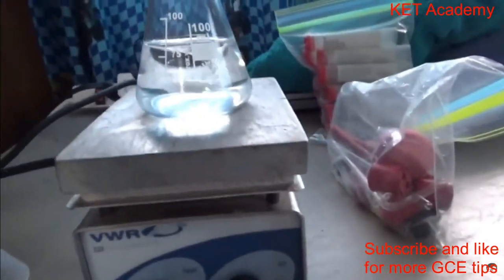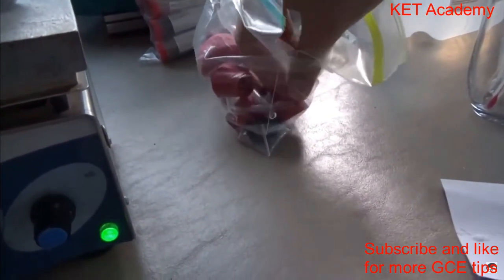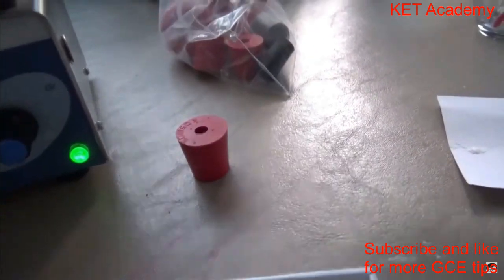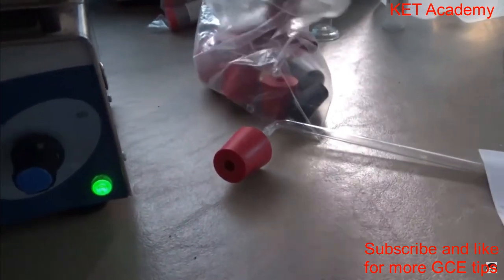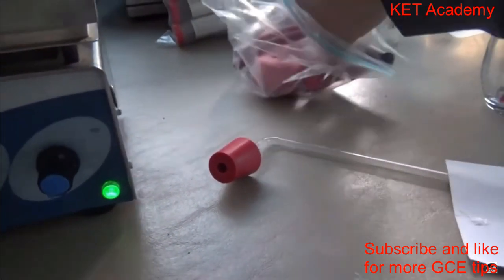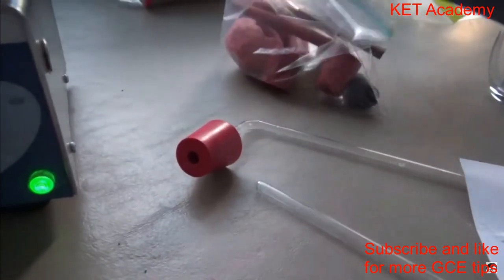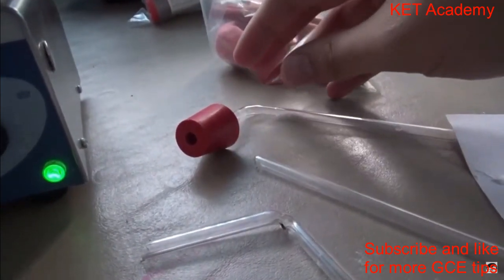Meantime, I want to set up my bubbler system. So here's what we're going to do. We're going to attach this stopper, and that'll go into this elbow joint. I'll have to grease that up first. I don't want to put that in completely yet. And then that will go into probably this one. Oh, actually, I want another elbow. There we go. Here's a second elbow, and that'll work just fine.